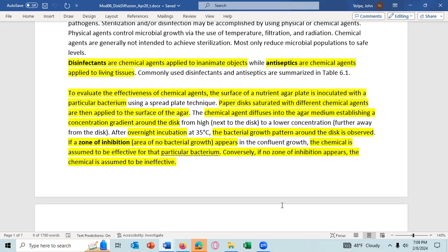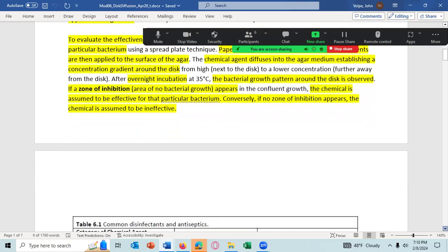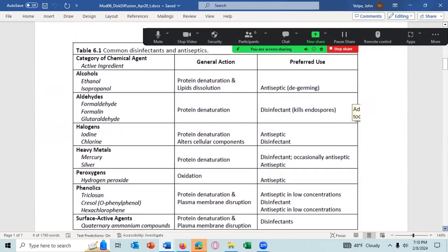So do you see the difference here? One place we're talking about is the bacteria sensitive, and the other we're just saying that the antibiotic was at least a little bit effective against the growth of that bacteria. Any question on that? All right. We'll talk more about sensitivity and resistance later on in this lab.